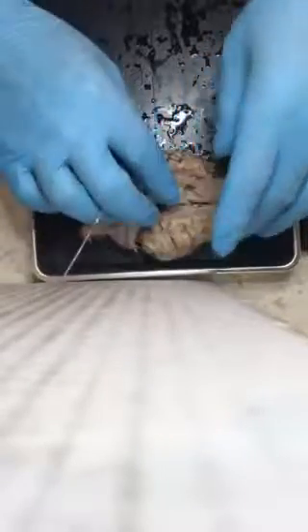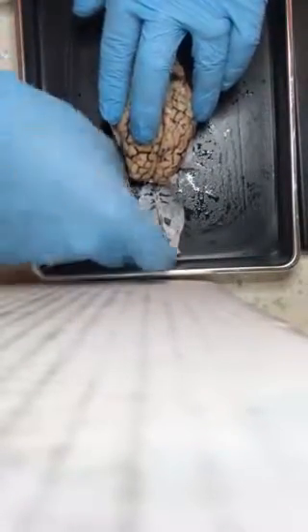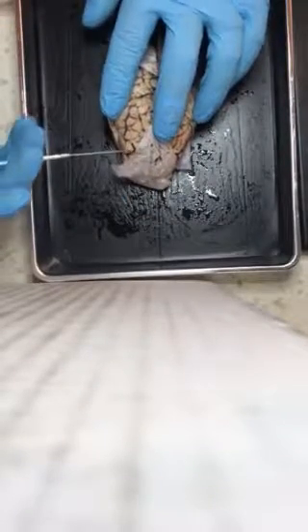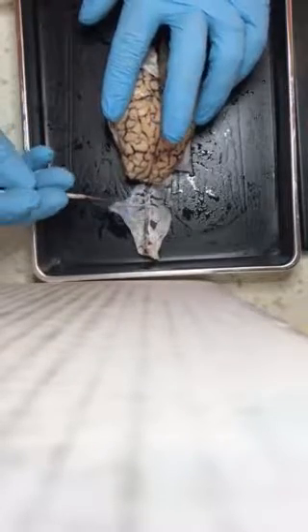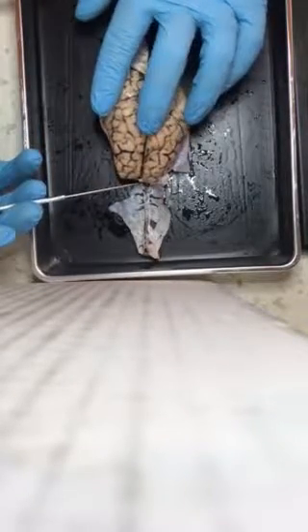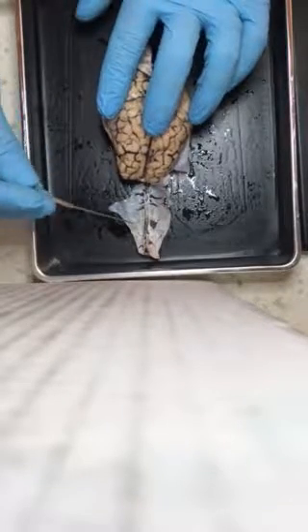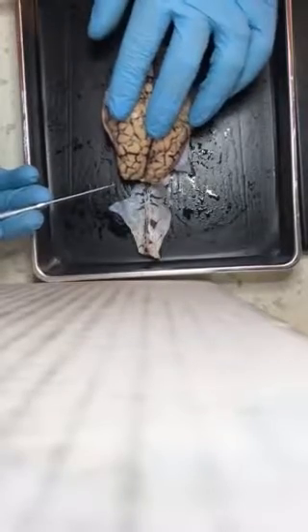The meninges, you can kind of see have been pulled back here. So the meninges are three different layers. The outermost layer is going to be the dura mater. So this is the dura mater here. Directly underneath that, you have a web of the different arachnoid meninges. So they branch off, and then beneath the arachnoid meninges, you have the pia mater.